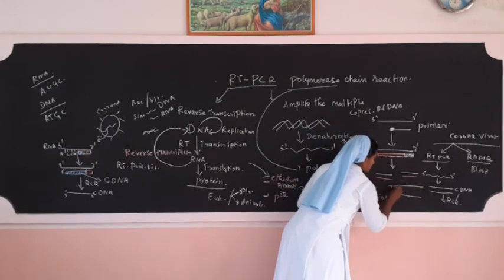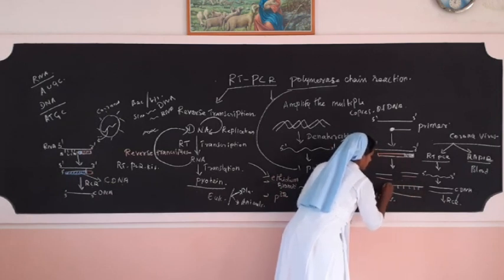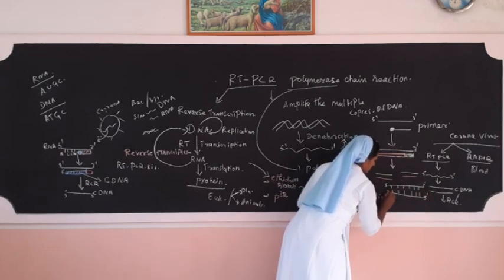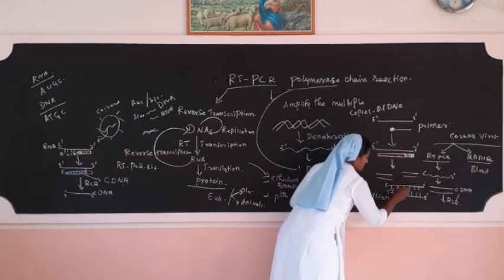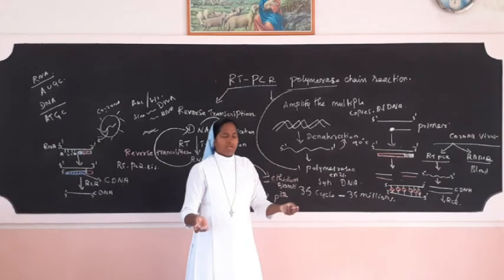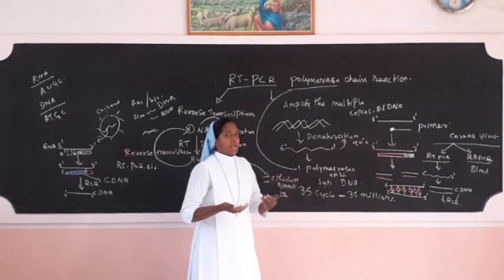Now suppose they have formed 2 strands, these 2 strands, what forms? The sequences in the DNA, and then the newly formed DNA here, if they are complementary or matching, the dye will bind. The dye will bind here when we apply. The more color is formed, the more copies have formed. That's the thing we can understand.